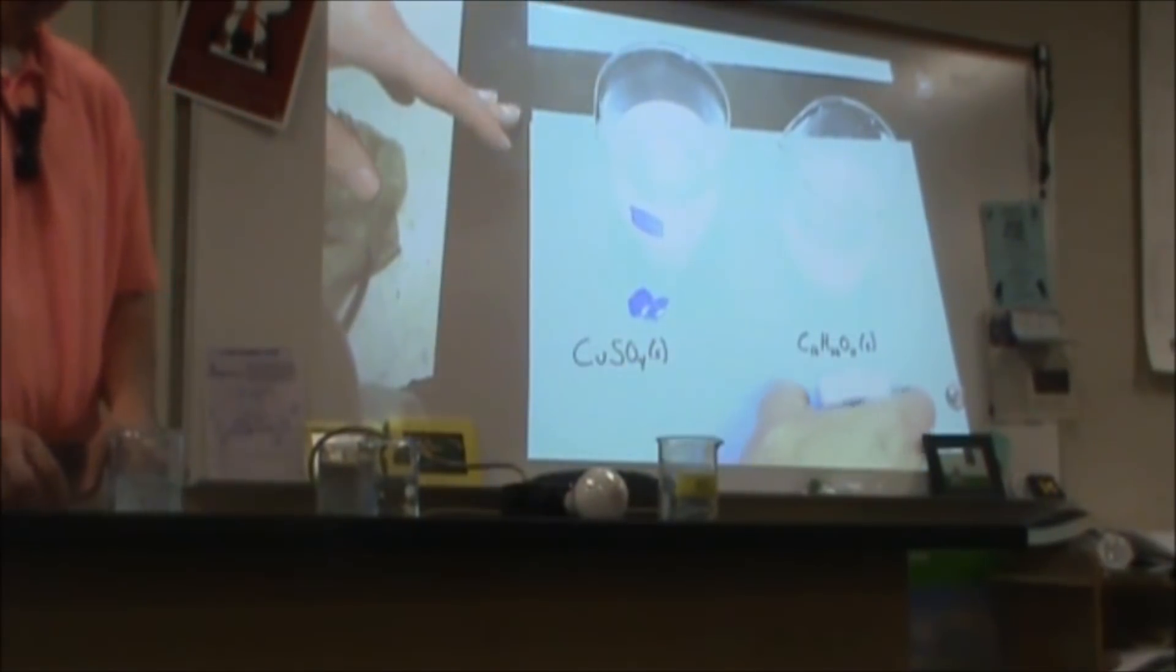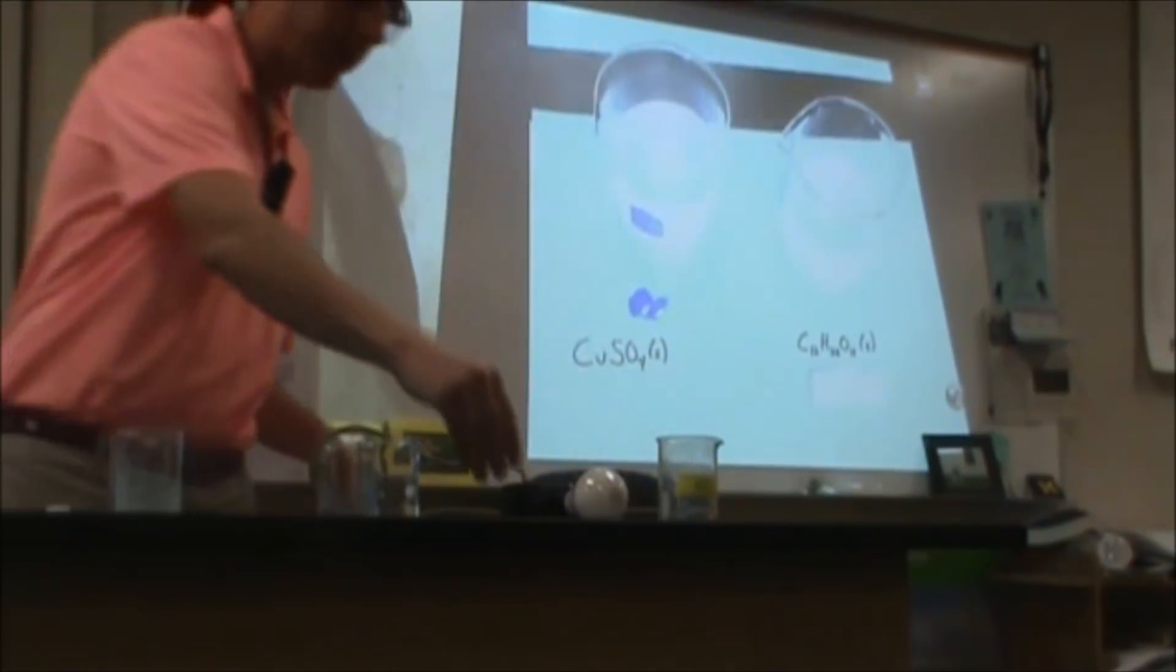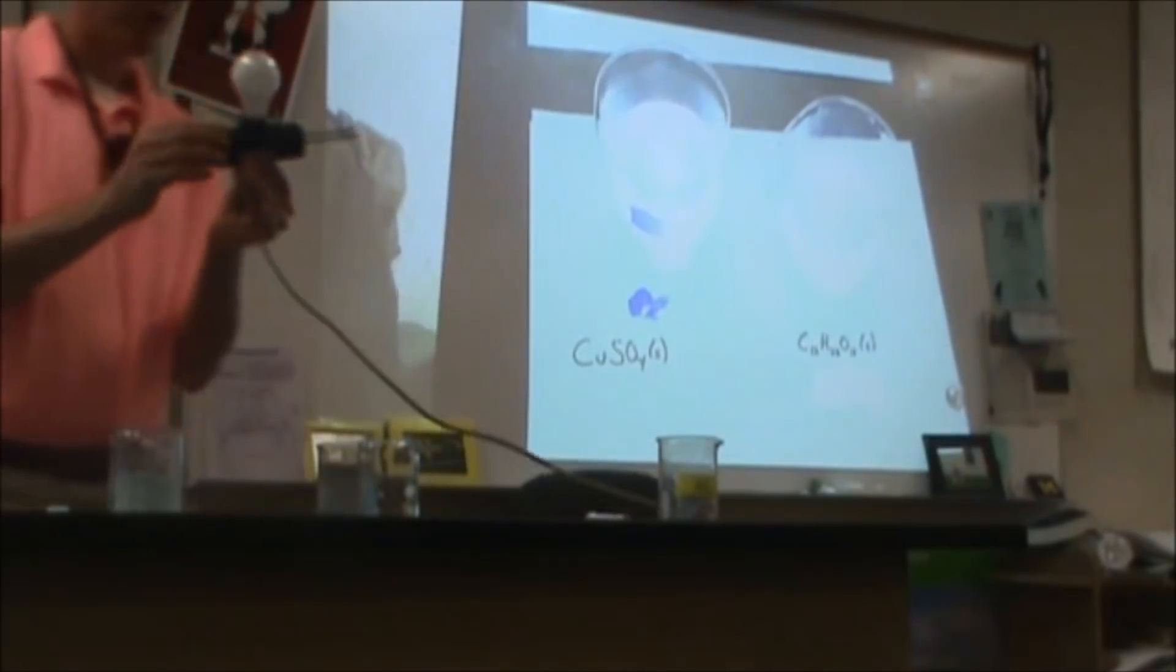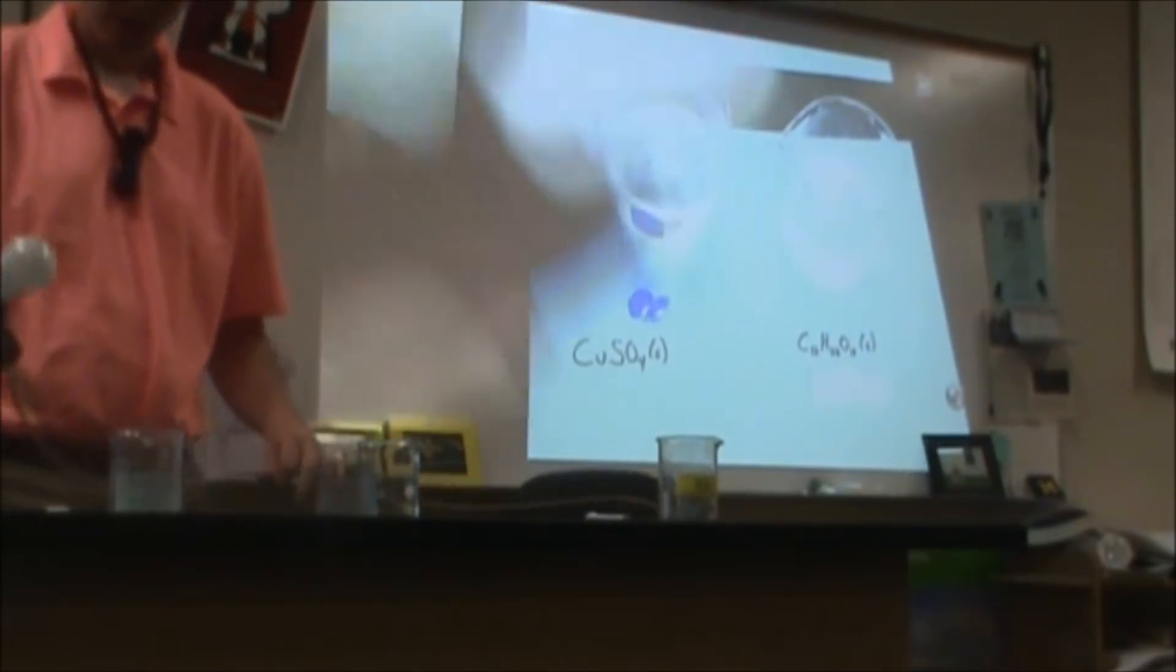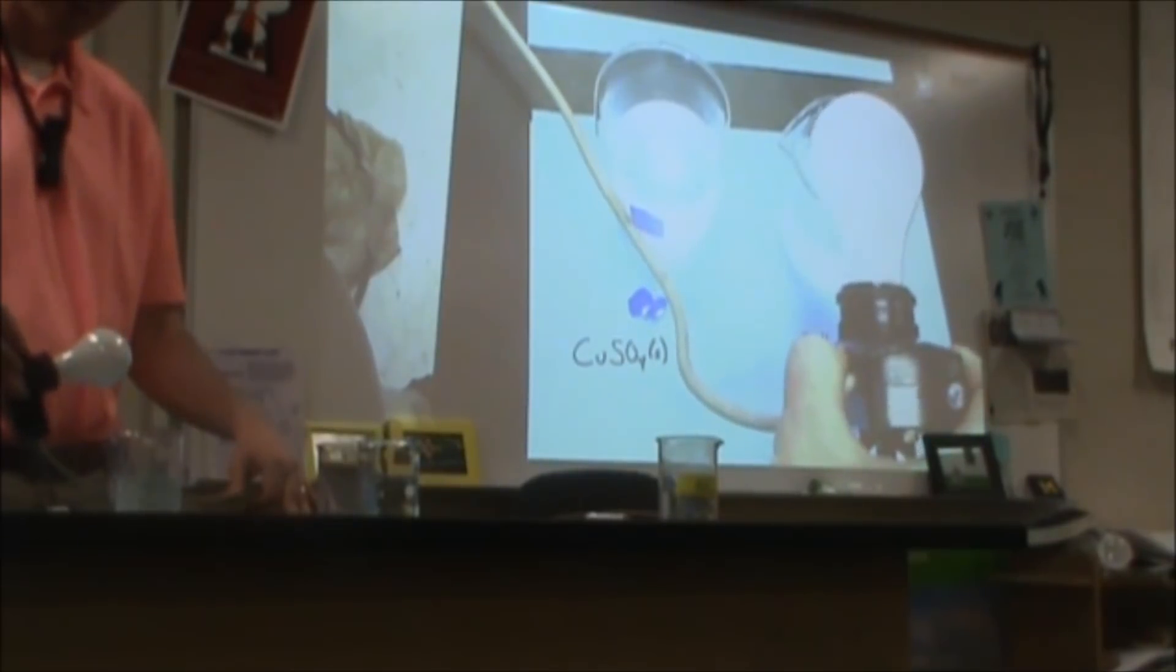Here I have two different solids. I have some sugar cubes, sucrose for the most part, and some copper sulfate. It's hydrated, but what we're going to do is show that in the solid form, when I put up a conductivity detector to them, that they do not conduct electricity.